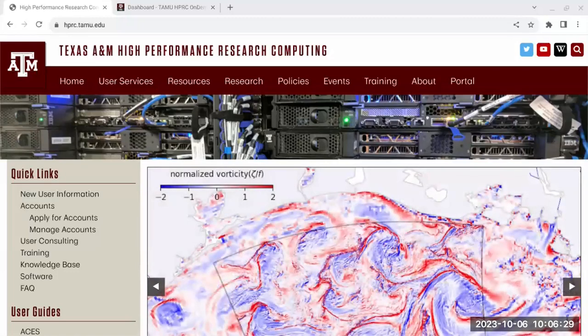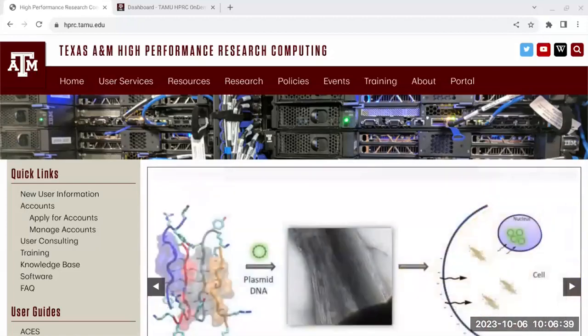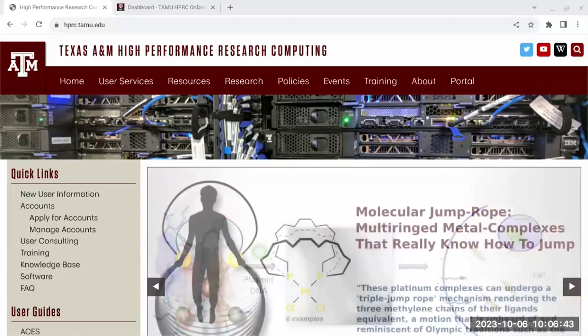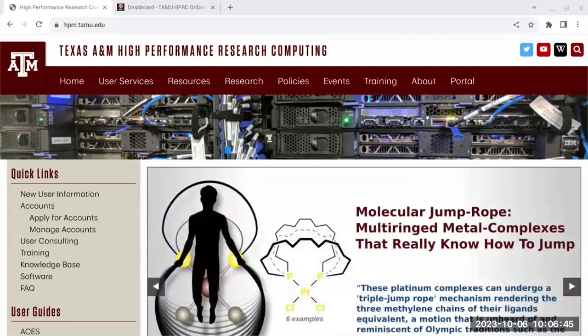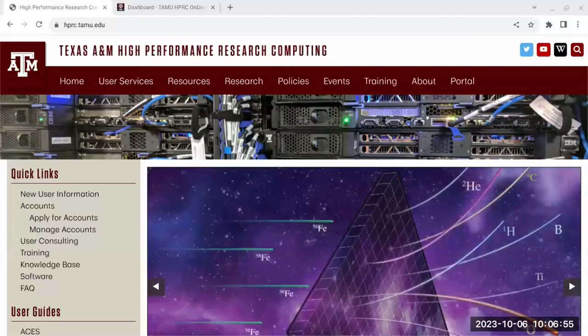Once you get used to using the command line, you'll see how useful it is, and you do have to learn Unix commands and find an editor that works for you. But it's a great way to work on projects, and especially when you have a lot of files and a lot of different jobs, working your way on the command line is very useful.